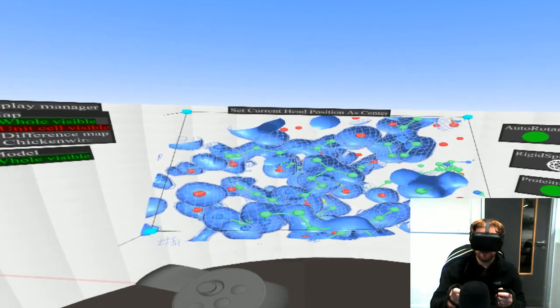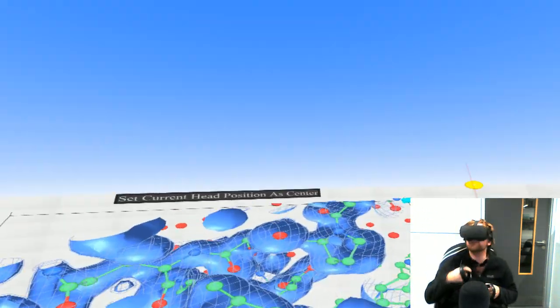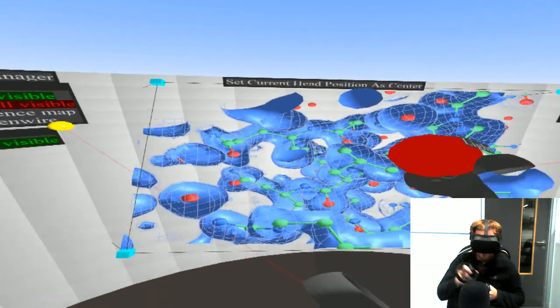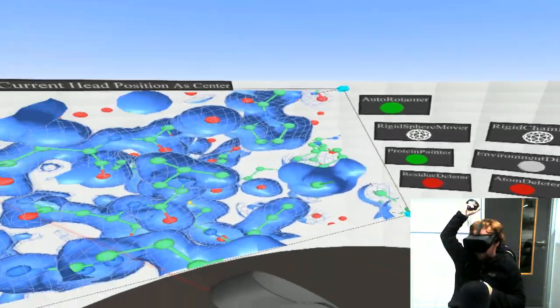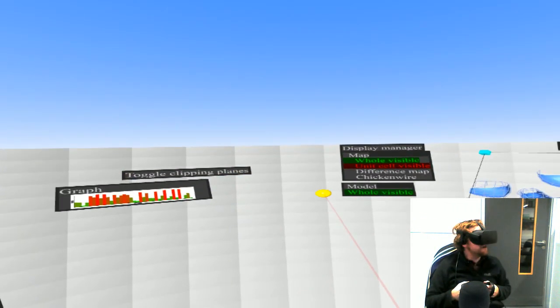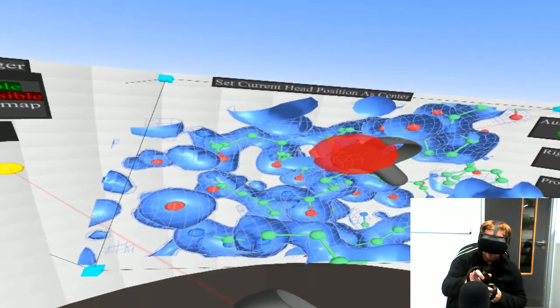I'm a little bit worried. Tell you what, I'll move back a bit, and then that recenters me, puts me in the center of this environment. One thing you might have been thinking about, this is my light. I can move it around here, but not hugely useful, though maybe in some certain circumstances.